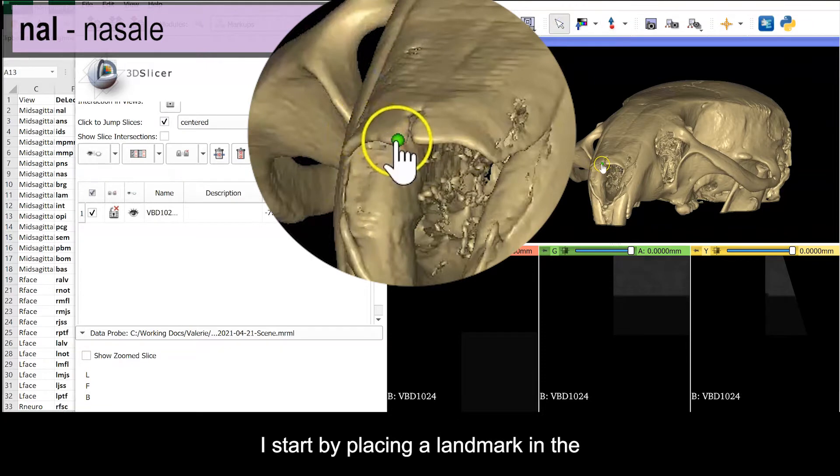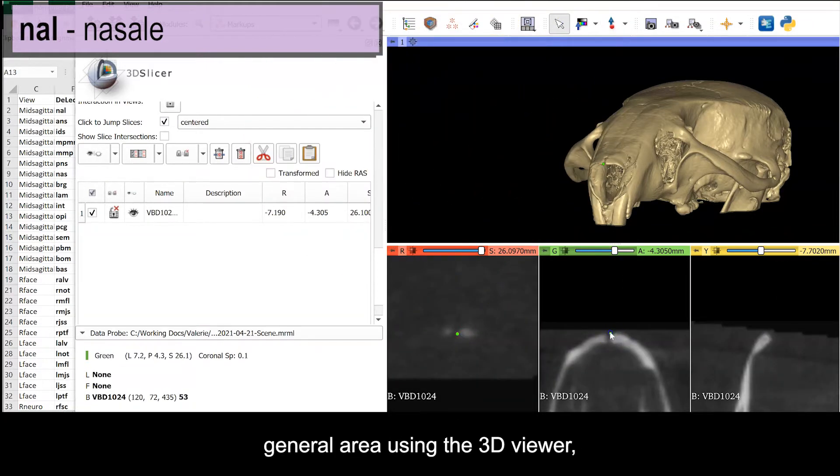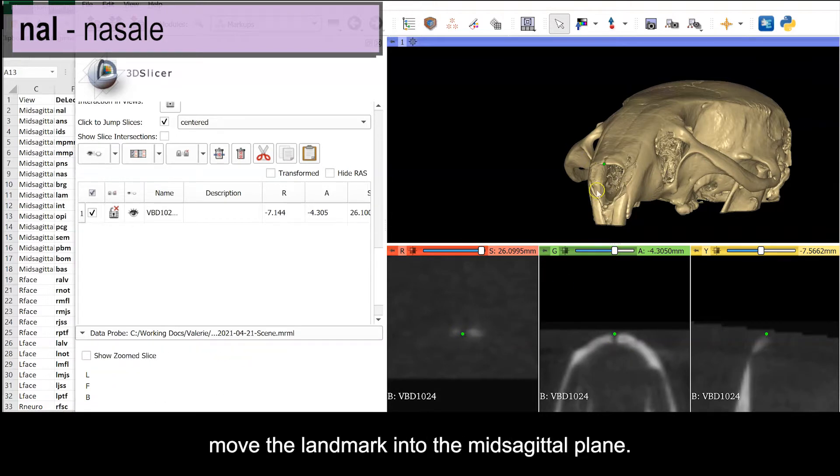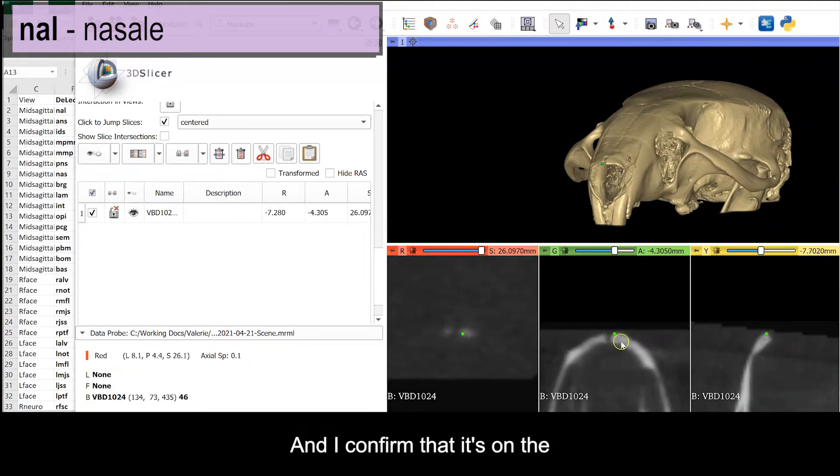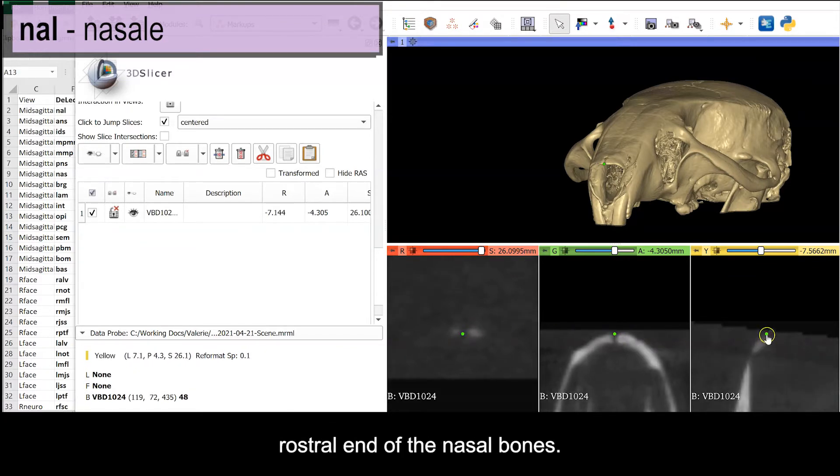For all landmarks, I start by placing a landmark in the general area using the 3D viewer. And then I use the orthogonal views to move the landmark into the mid-sagittal plane. And I confirm that it's on the dorsal surface and at the most rostral end of the nasal bones.